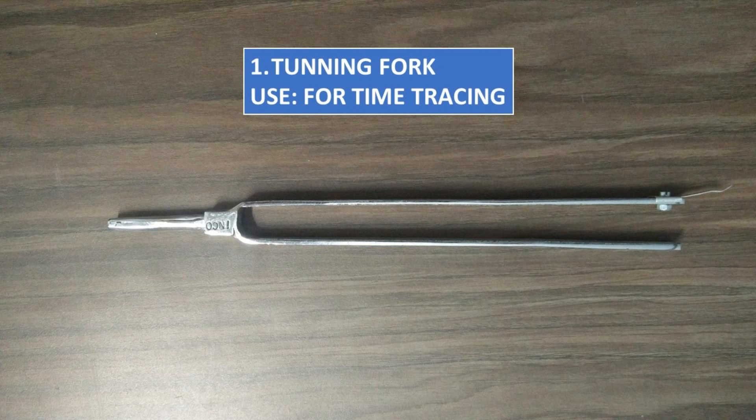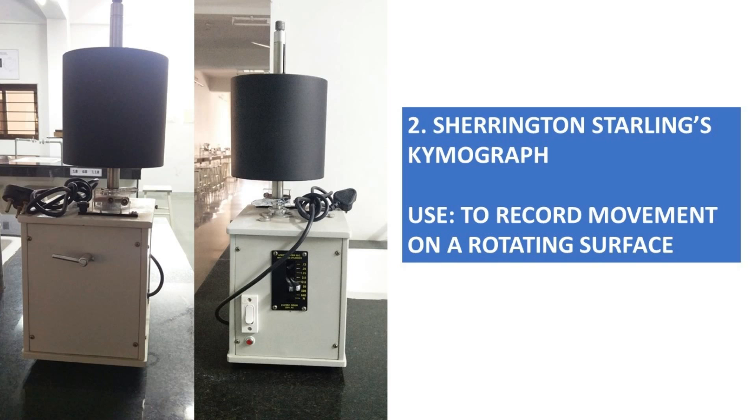Tuning Fork, for time tracing. Sherrington Starling's Kymograph, to record movement on a rotating surface.